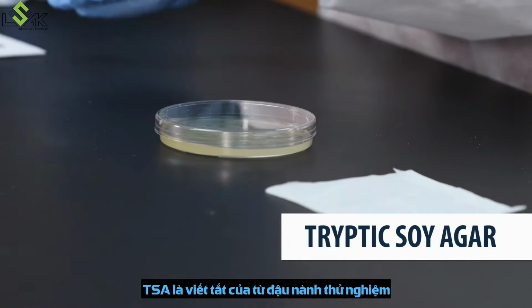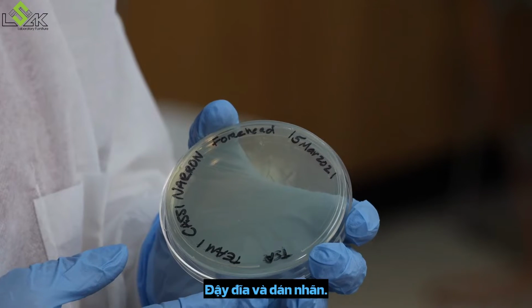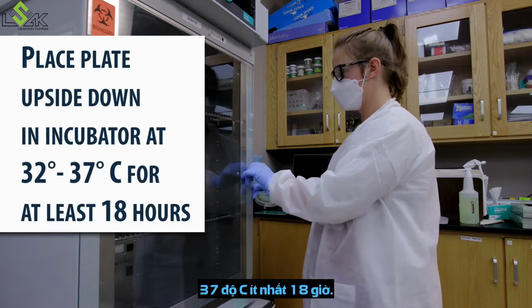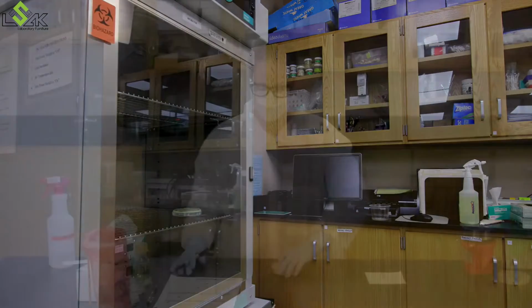TSA stands for tryptic soy agar. It's like food for microbes. If there are any present, they're going to grow, and we'll be able to see them. Cover the plate and label it. Then place it upside down in the incubator at 32 to 37 degrees Celsius for at least 18 hours. We'll check back on this plate in a moment.